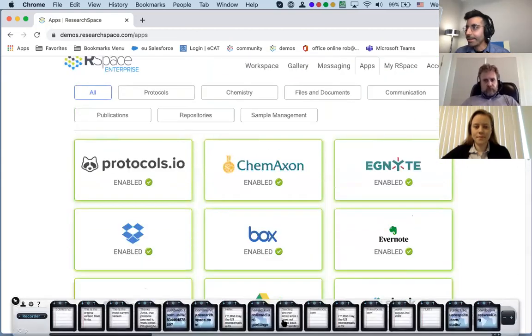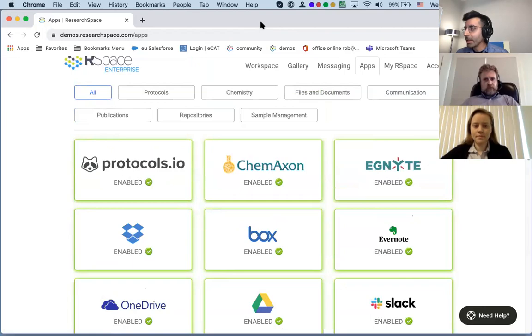Okay, great. And then, Anita, do you have any insight on how long it takes to set up the protocols.io integration? Not exactly, but we are integrated with a whole bunch of tools too. A lot of them are similar to the ones with RSpace. We are integrated with Dropbox, Google Drive, Box, OneDrive, and then also you saw the Slack integration.